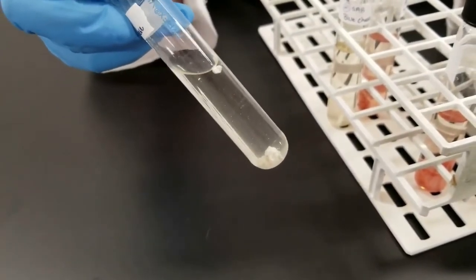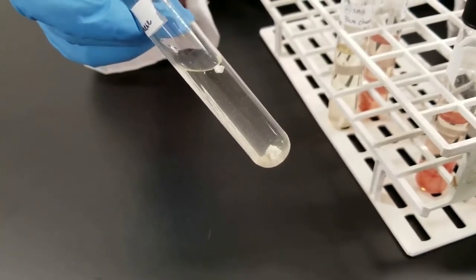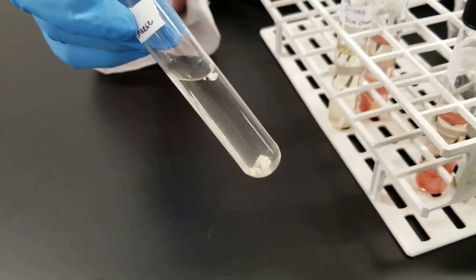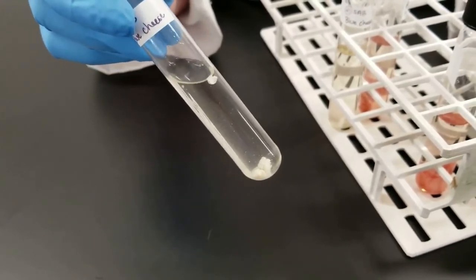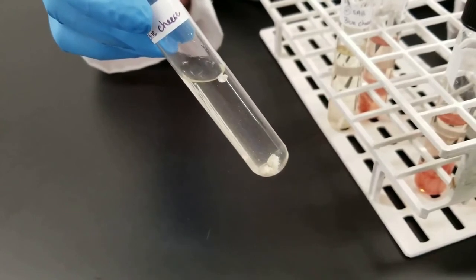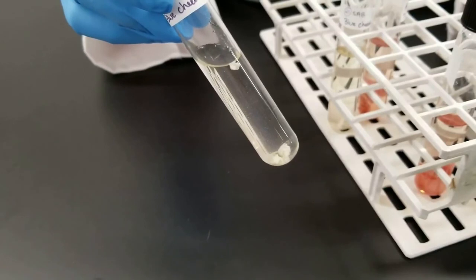Fungi typically will grow a little bit slower than the bacteria will. So sometimes you have to leave these. This is only about 24 hours of growth. You often would have to leave fungal media that you've inoculated a little bit longer to get extensive growth as compared to bacteria.